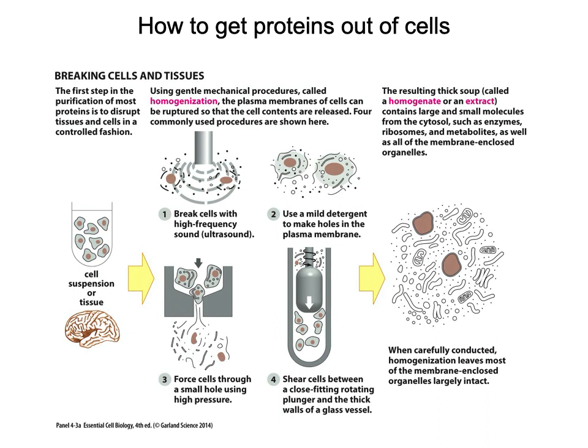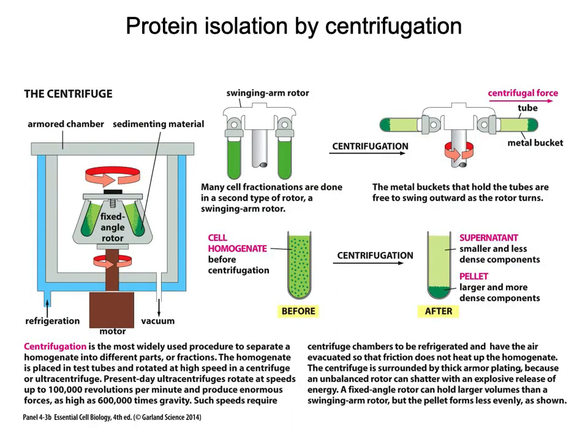So once you have your lysate, your next step would probably be to centrifuge. Okay, and so the reason why we're going to be centrifuging is we want to make sure we're isolating proteins. If we think about our bodies, we're made up of a lot of water, and same thing with the cells. And so we're not looking to collect all of that necessarily. A lot of times all we want to do is look at the protein fraction, right?